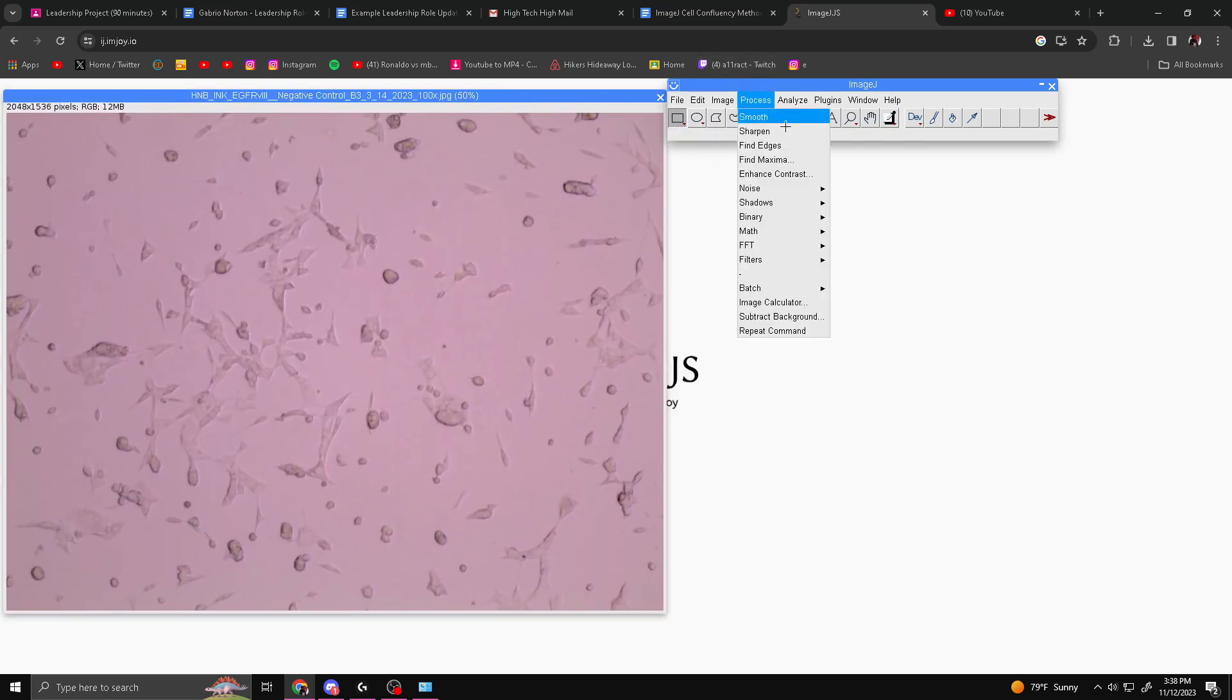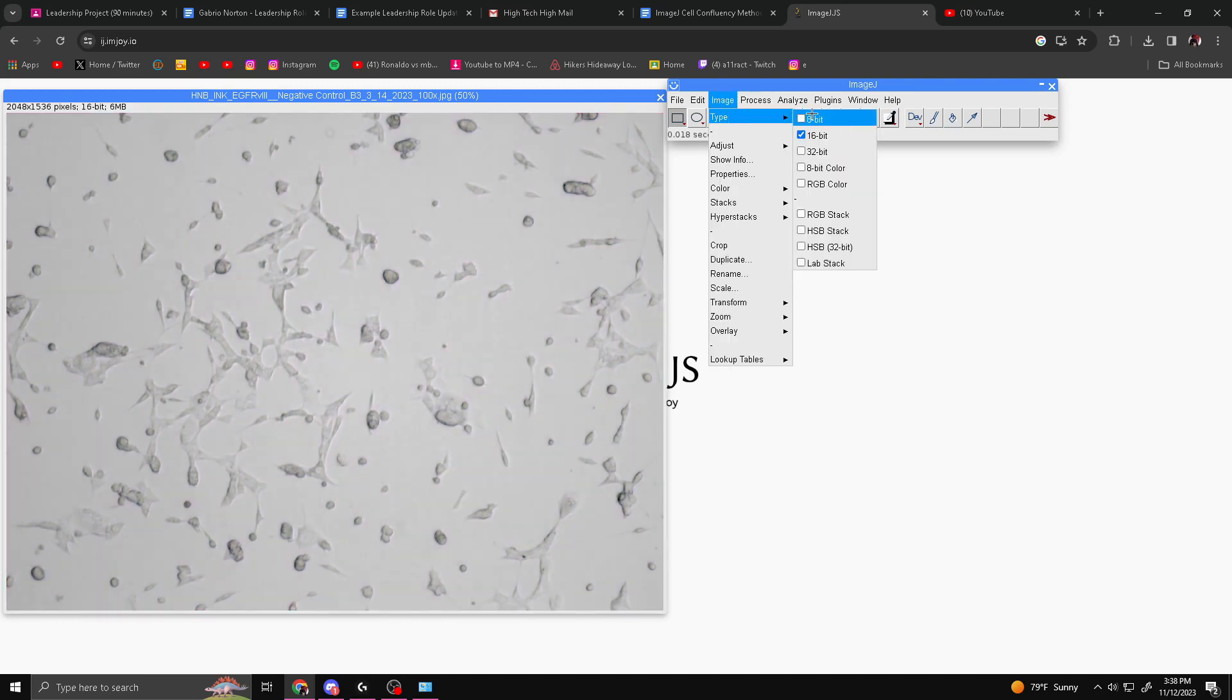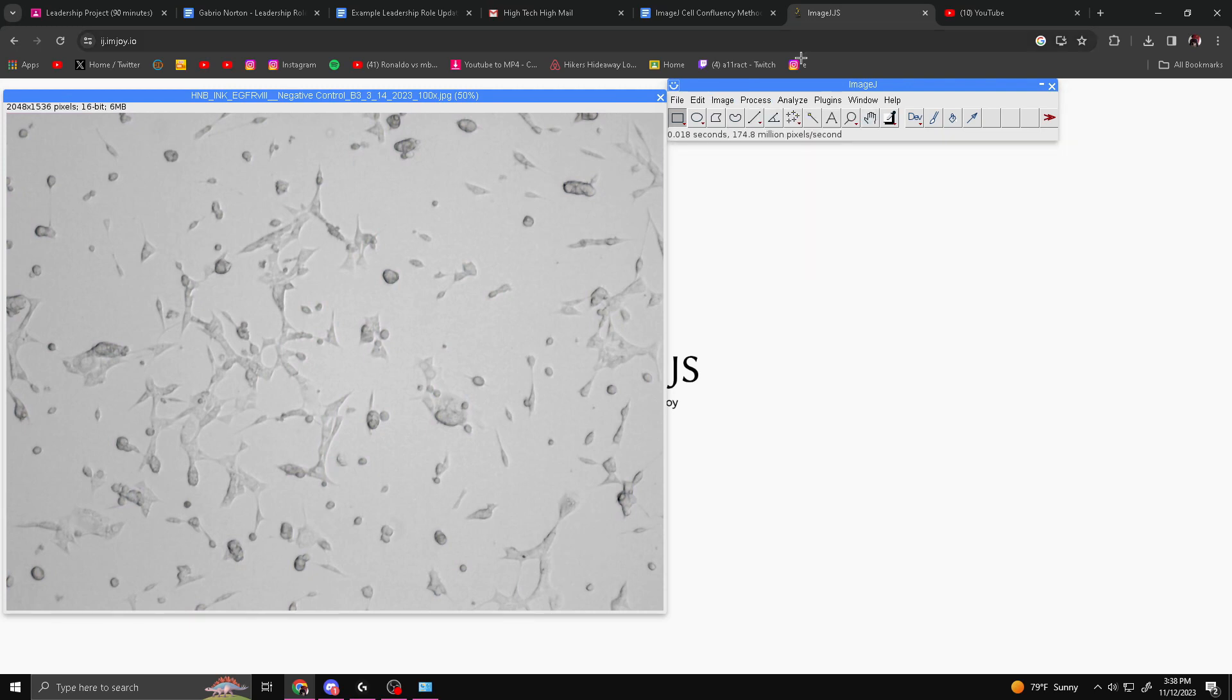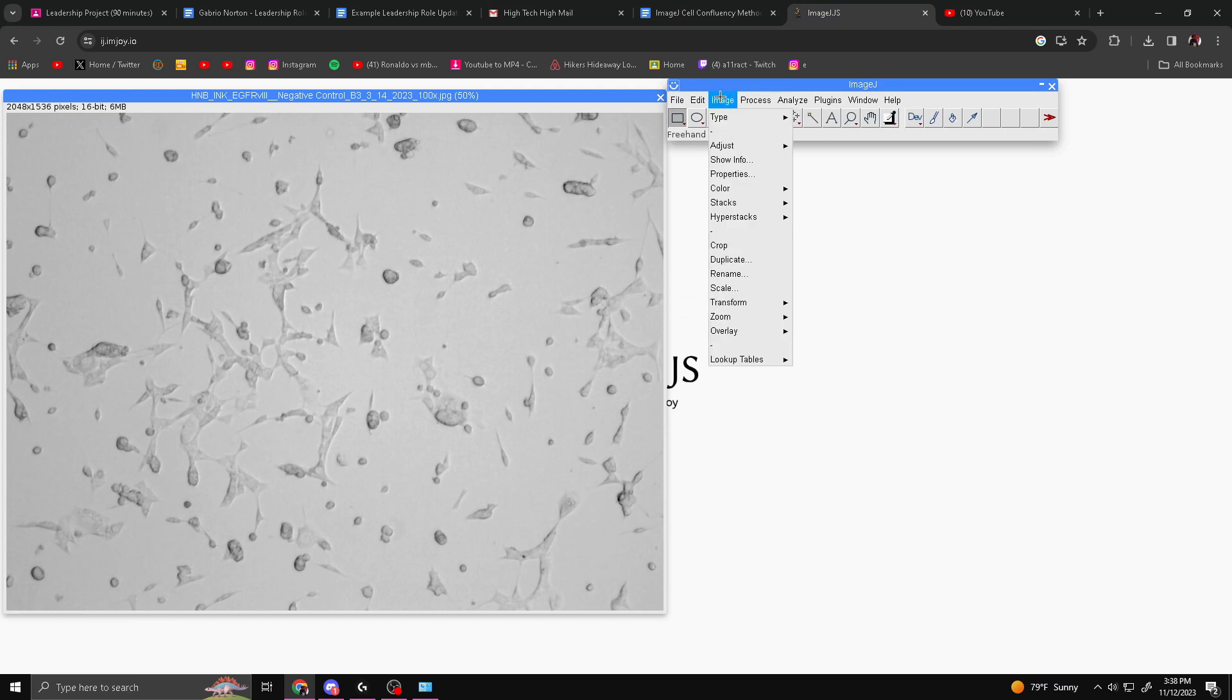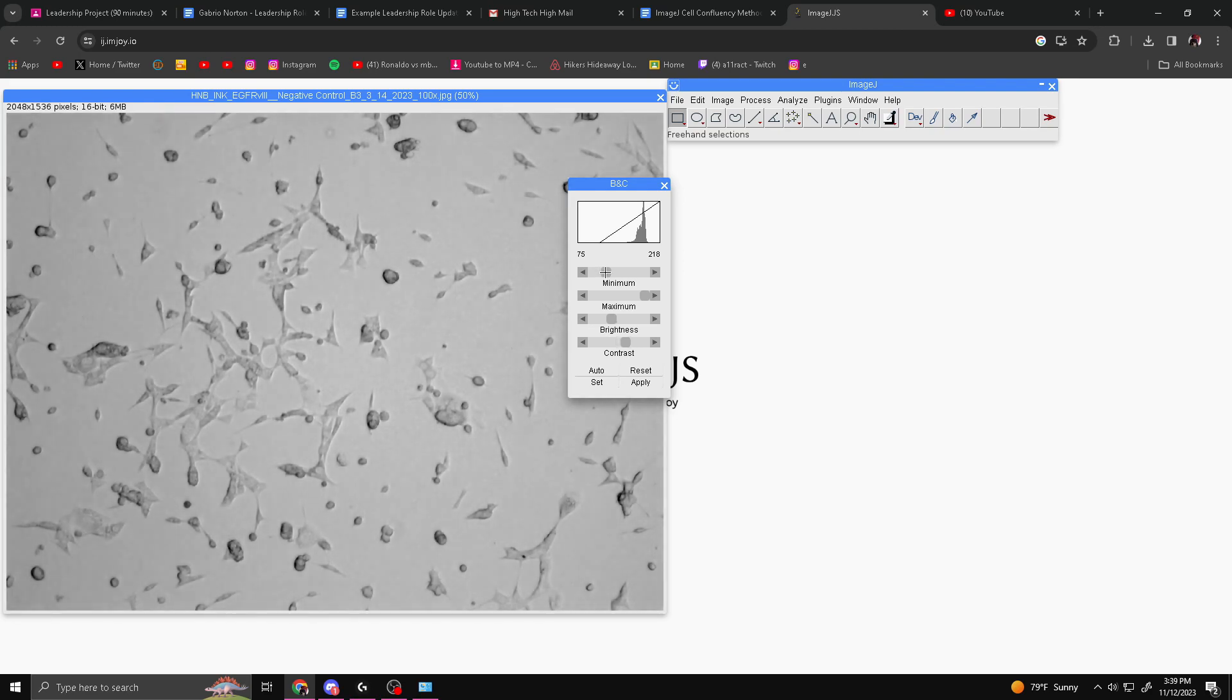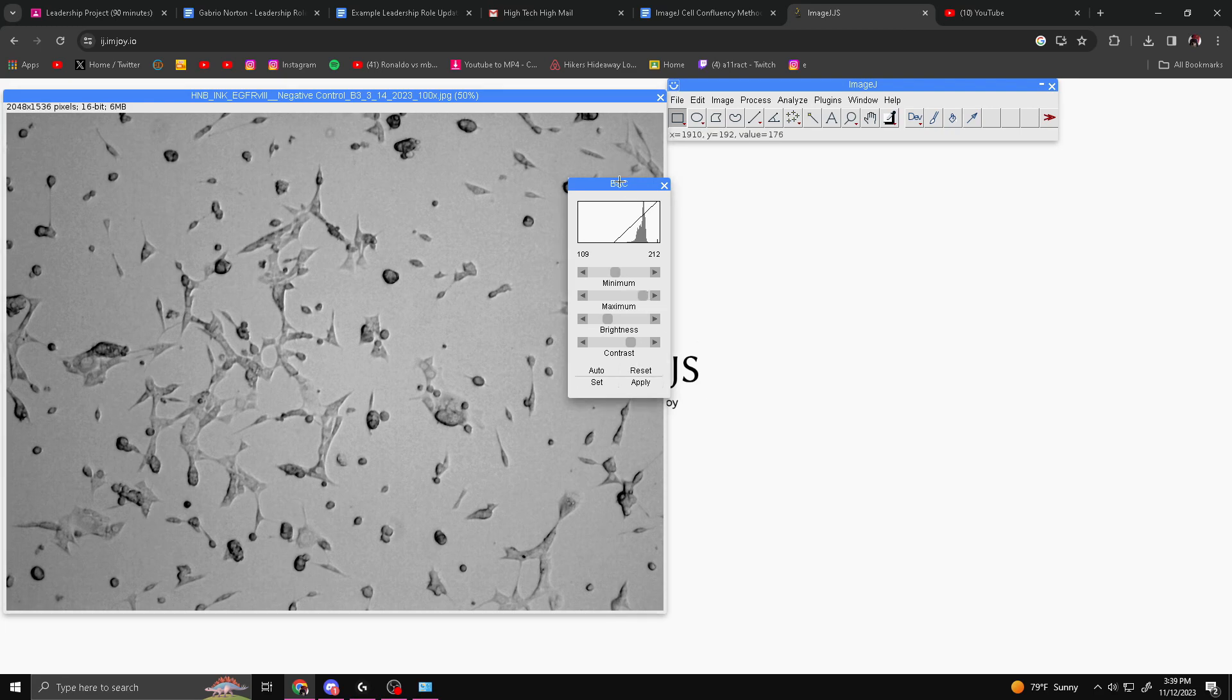Our first step is we're going to change the image type to 16-bit. You go to Image, Type, 16-bit. This will make the image grayscale so it's easy to work with. Next, you want to go to Image, Adjust, Brightness and Contrast. You're just going to mess around with it until the cells are visible but the background and blemishes aren't. You really just want to make it pop out more so it's easier to work with. Something about here works pretty well, but again you can mess around with it until you find something you like.